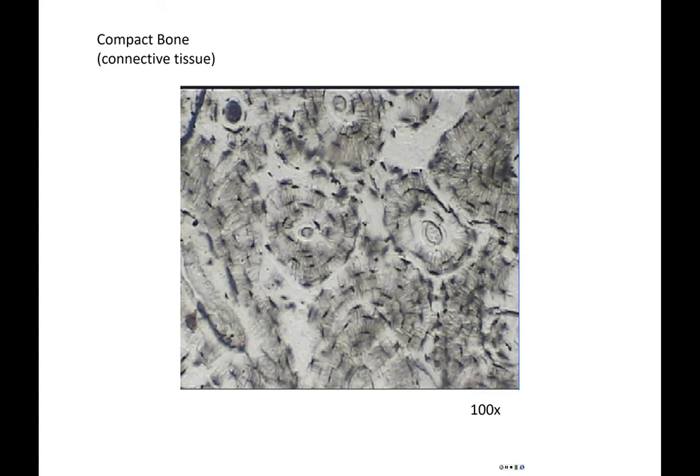The next tissue to look at is the compact bone tissue. So this is the tissue that is found in your skeleton. Your compact bone is characterized by these concentric rings which are called osteons. So you have at the center of each what's called a central canal. This is going to hold your blood vessels because remember this is living tissue. And then you're going to have your specialized cells called osteocytes in these rings around the central canal. And so you have these little canaliculi that connect the cells to that central canal. So that's how you're getting this very precise kind of arrangement. For me the compact bone is easy for me to memorize because it looks like tree stumps. So that's how I remember this one.